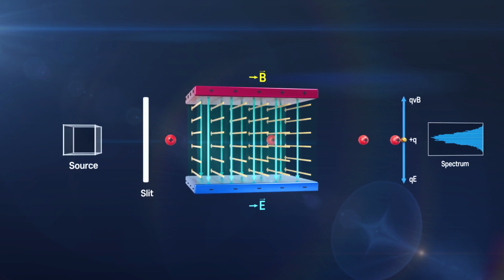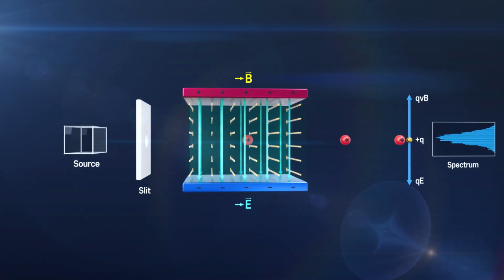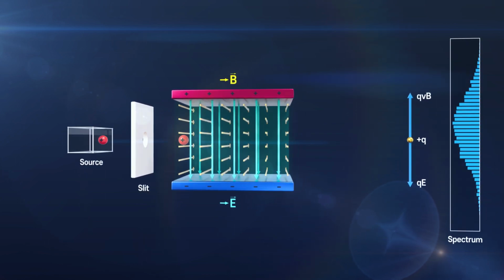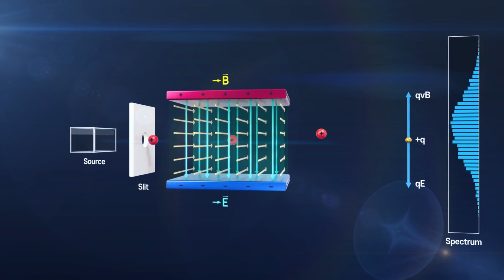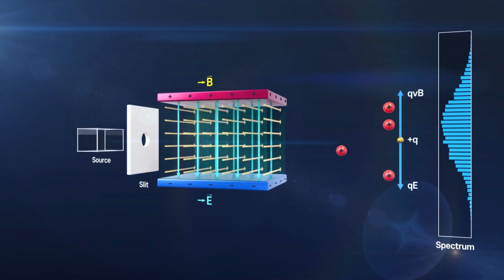He did not hold a vacuum because he thought that the alpha particles were so heavy that the air would not affect the experiment. In contrast to this expectation, the phenomenon of alpha particles being scattered by the air inside the measuring instrument occurred continuously.